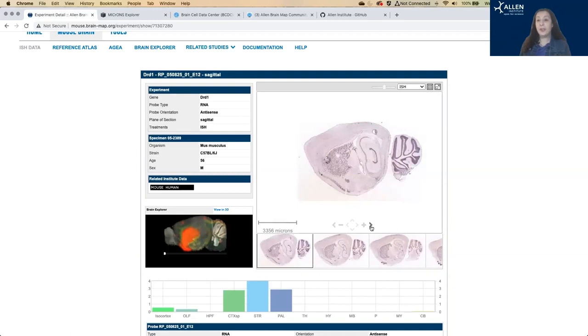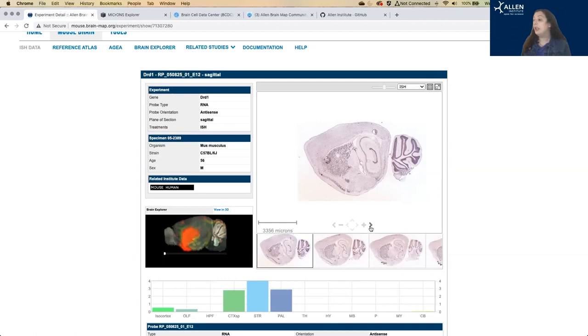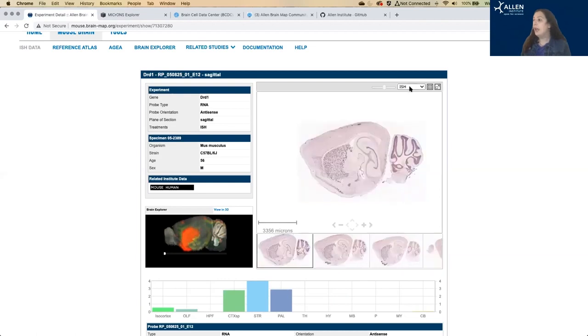For a coronal experiment, this would be moving from the anterior to the posterior of the brain. For each gene on each slice, we have the ISH that shows the relative location and the intensity of the gene expression.